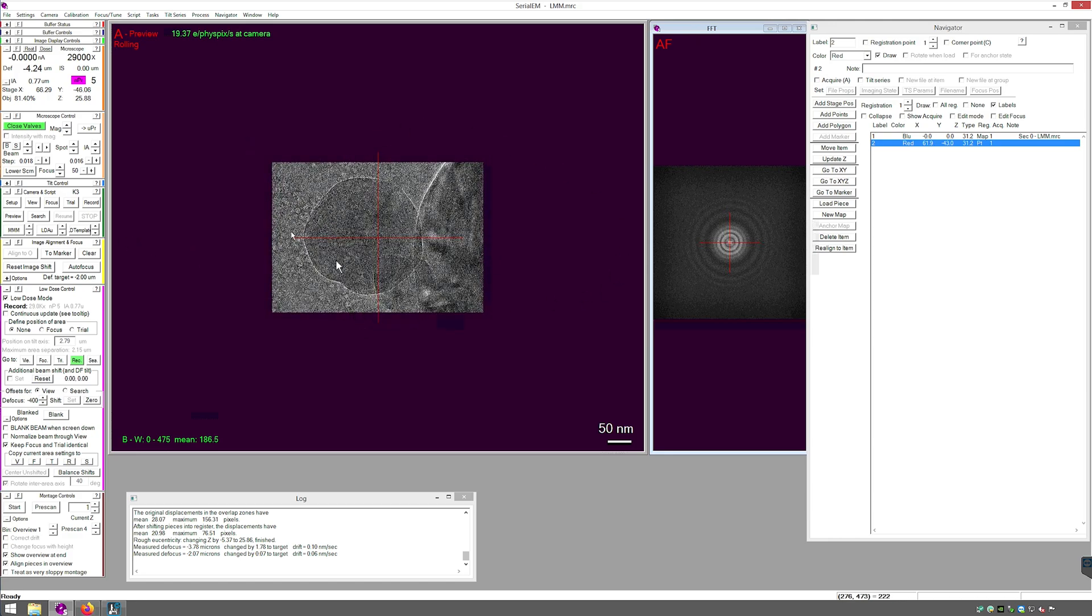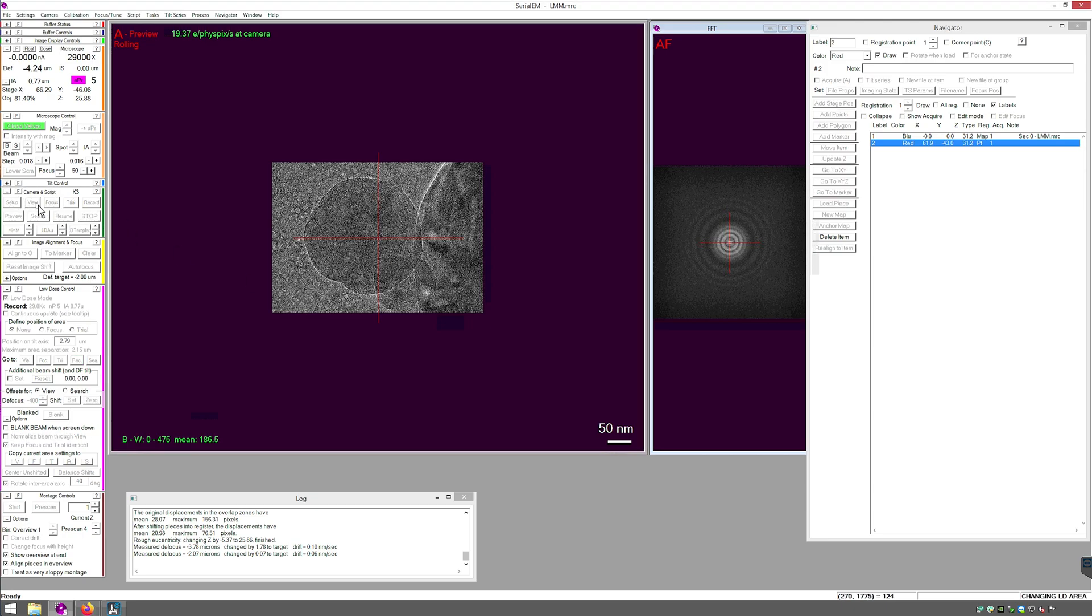Now I have this piece of contamination centered in record with the stage. And what I mean by centering it with the stage is that there is no image shift. I can verify that by looking in the microscope panel and right next to IS 0.00 microns. Now I will acquire a view image and adjust the offset.